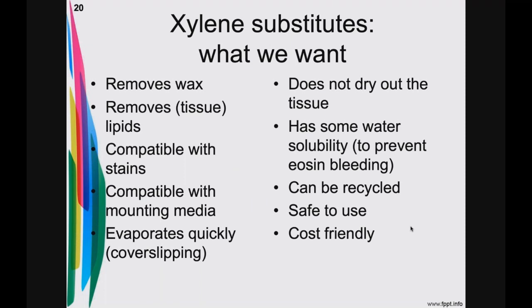So what do we want our xylene substitute to do? That's what xylene's doing for us. What do we want? It's got to remove the wax. It's got to be compatible with the wax so we can make paraffin blocks, and it better be able to remove it after we've cut it.